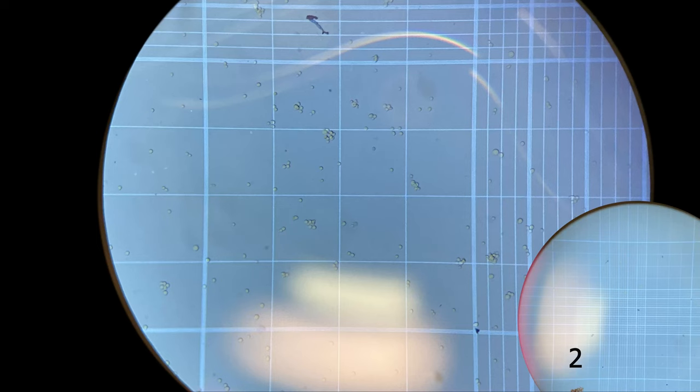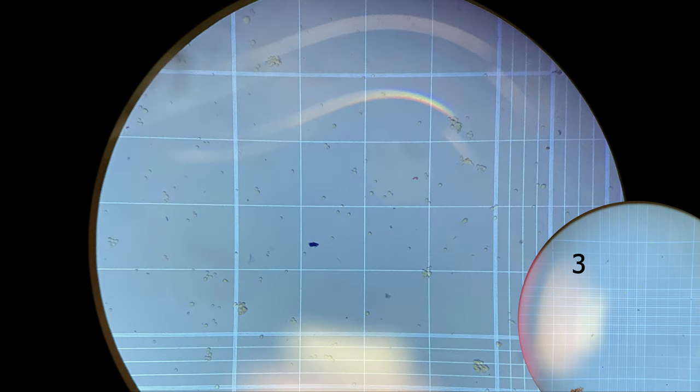Let's count the rest of the cells. We look at the bottom left-hand corner, I see 109 live cells, no dead cells. I look at the top left corner, I see 72 live cells and one dead cell. The dead cell would be in the second box from the lower corner. Here is the top right corner, I see 101 live cells, no dead cells. And the middle square, I see 124 live cells and no dead cells. Notice there's a little bit of clumping in here, so make sure you're pipetting up and down to break up those clumps.